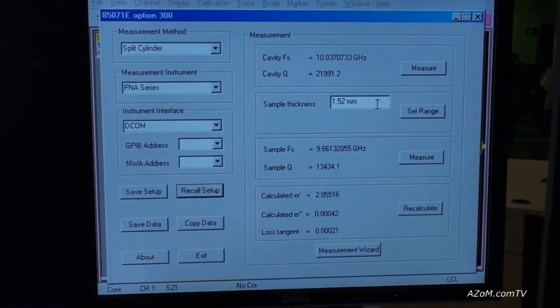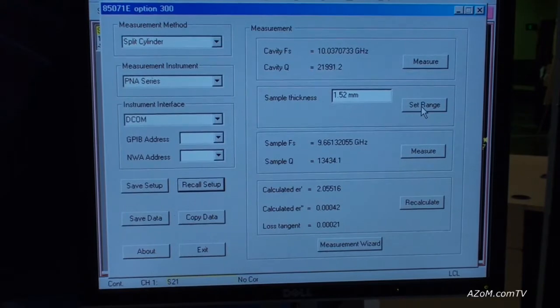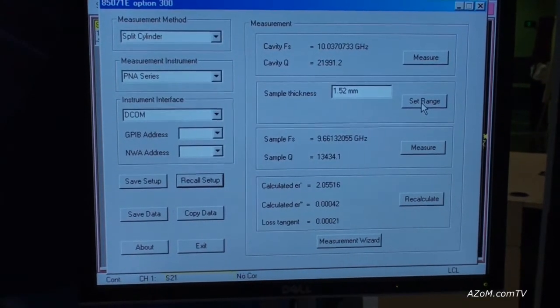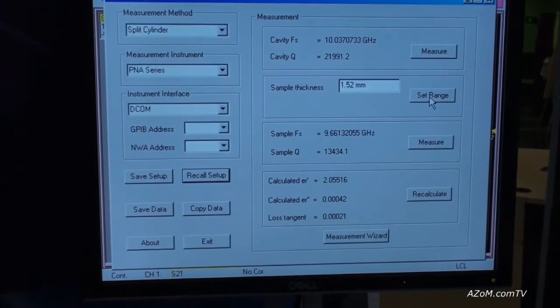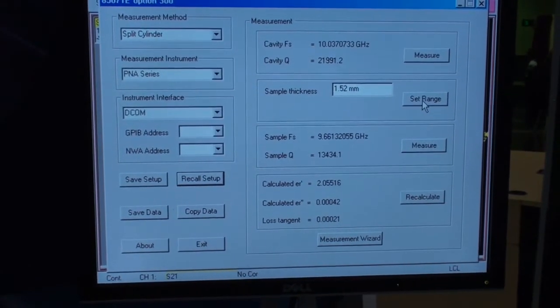The next step is to enter the sample thickness and then set the range. So I've selected the frequency, the first usable mode which is the TE011 mode which occurs at around 10 gigahertz.